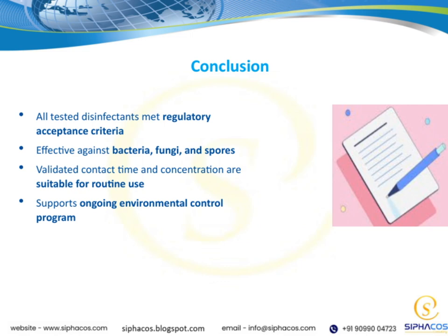Additionally, the validated contact times and concentrations we've established are suitable for routine use, making these disinfectants practical for everyday application. This supports our ongoing environmental control programs by providing proven, effective solutions. Overall, these results reinforce that we're using disinfectants that are both effective and compliant, helping us maintain a safe and clean environment consistently.